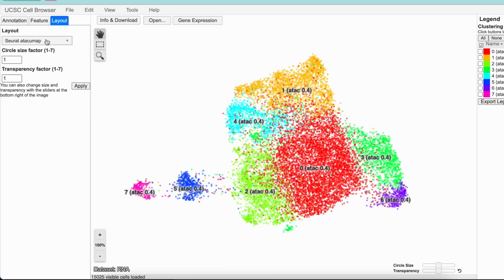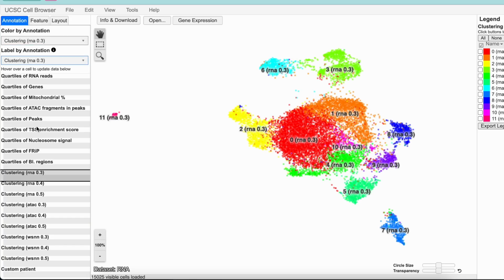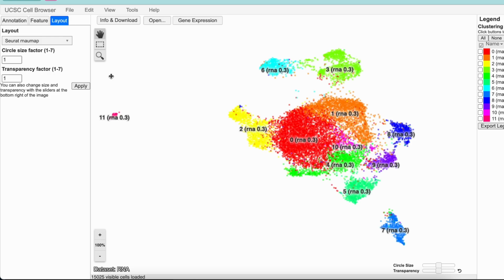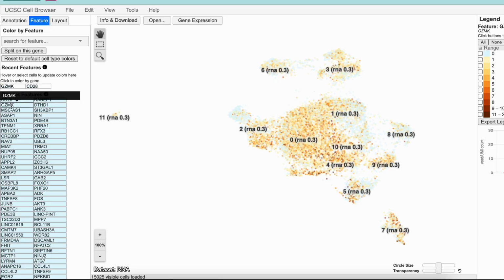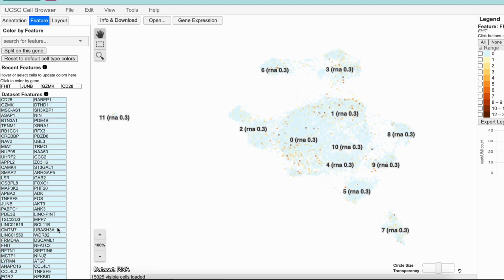And we also could see the cluster markers. Because it identifies the cell markers automatically, you have the list of them right here. It's very convenient to see how markers are distributed between the clusters. Together with peak markers and genes of interest, it is helpful for cluster annotation.